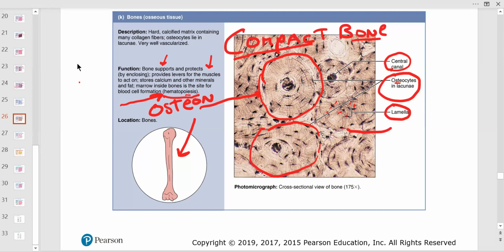So all your blood cells, red blood cells, which is what your body needs to carry oxygen, white blood cells for your immune system, like the macrophages and the leukocytes and the neutrophils and the mast cells, are all part of that. And then the platelets too for clotting. So it all happens in the bone, and technically not in this compact bone though, but still you have to know this is bone tissue. I think this is the easiest thing to see. Bone tissue, what that looks like.